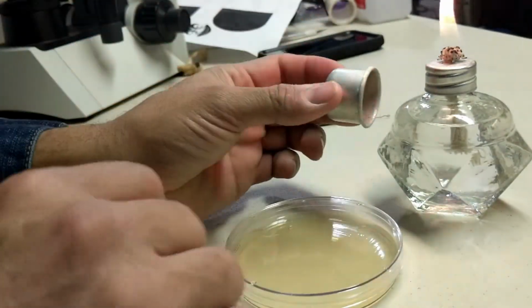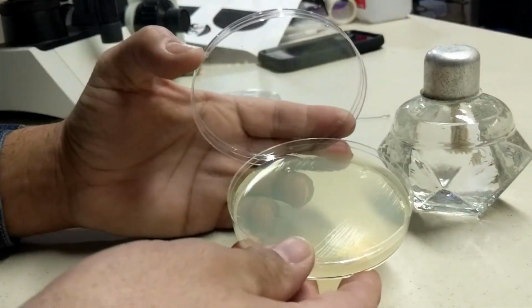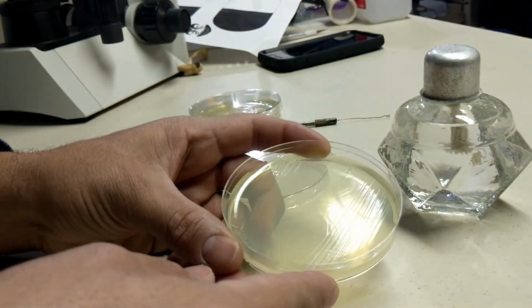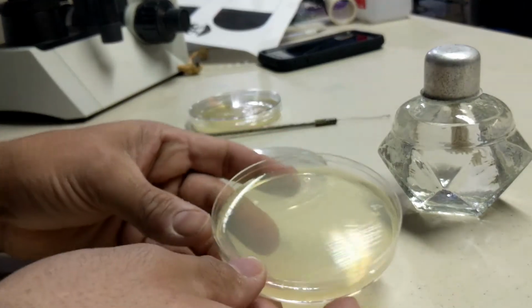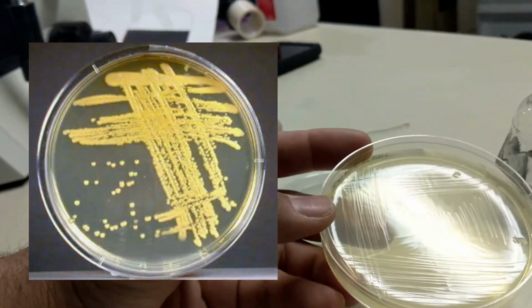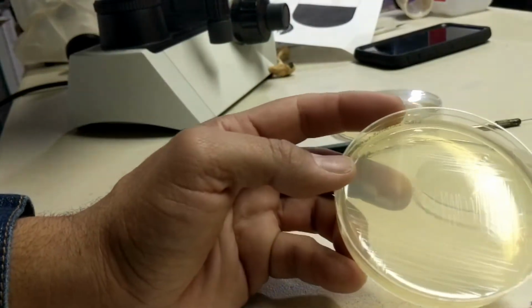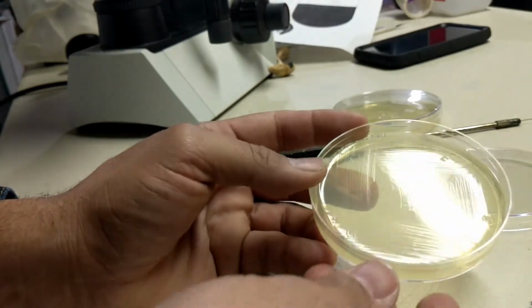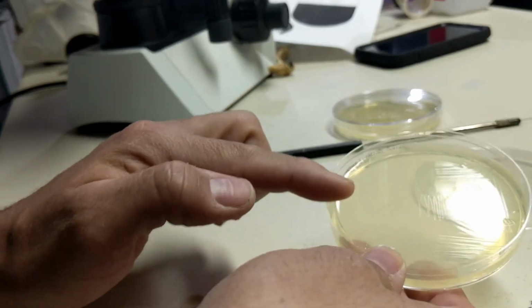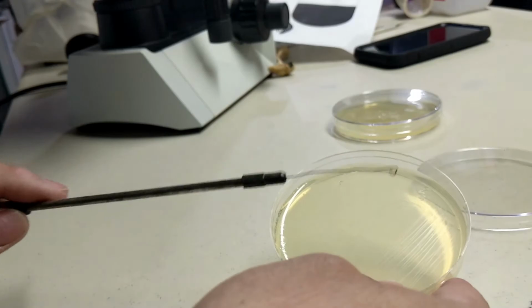Sterilize this. Put it aside, and now I'm just going to close this. All right? So you can actually see, let me try to look for the light. You can actually see the marks in there. Especially I want you to see the last quadrant. So in this case, you can see the first one in here, second one in there, third one, and the last quadrant, you can see it in there.